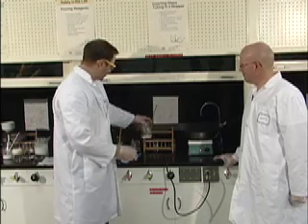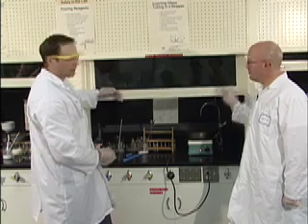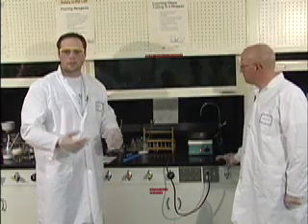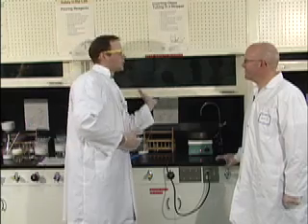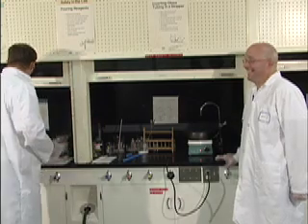Now I'm doing something very wrong right now. Can you tell me what it is? I would probably say that I'm smelling something that I shouldn't smell. Exactly. You don't want to take these out of your fume hood. You want to leave this in your fume hood, and in fact, you want to keep the fume hood down about halfway, so that everybody doesn't smell like vinegar when they leave here. I sort of like the smell though. Well, to each his own.